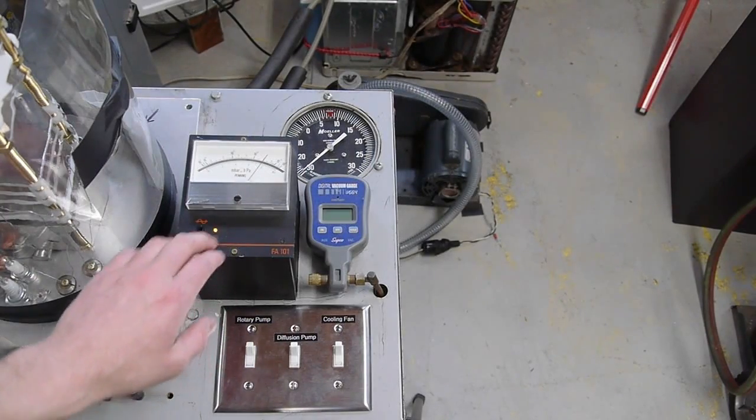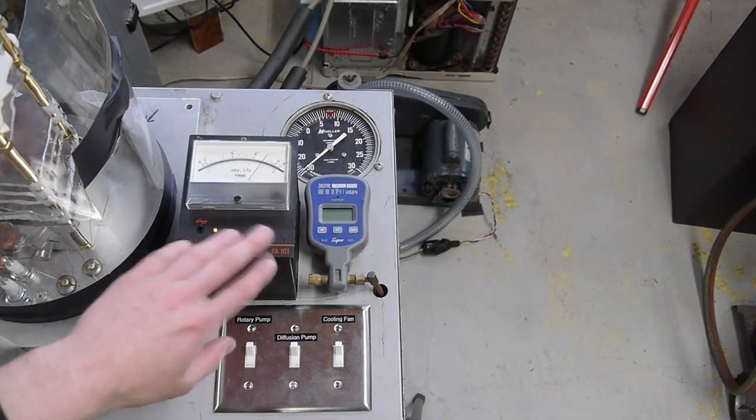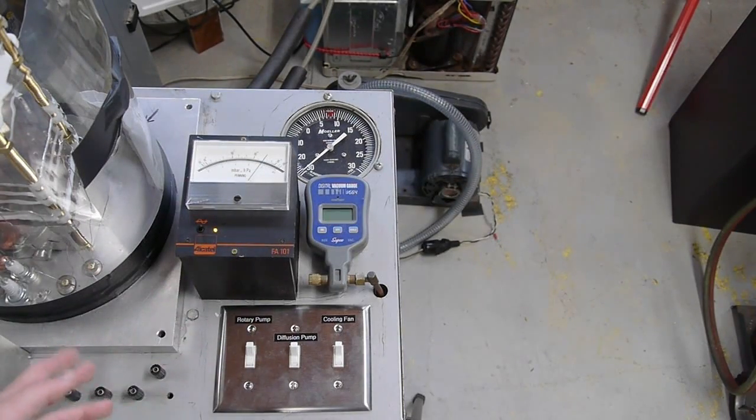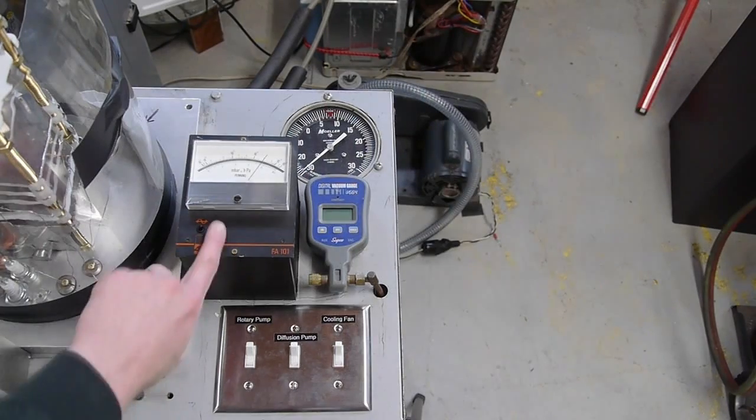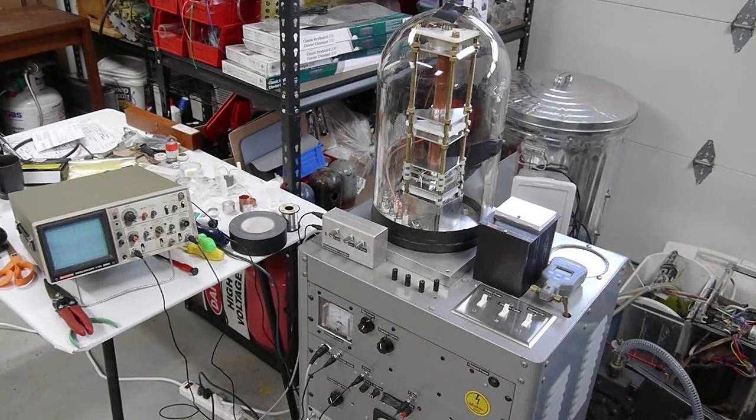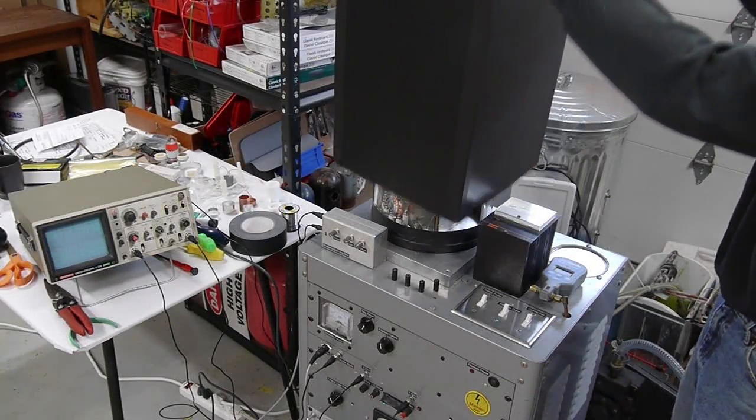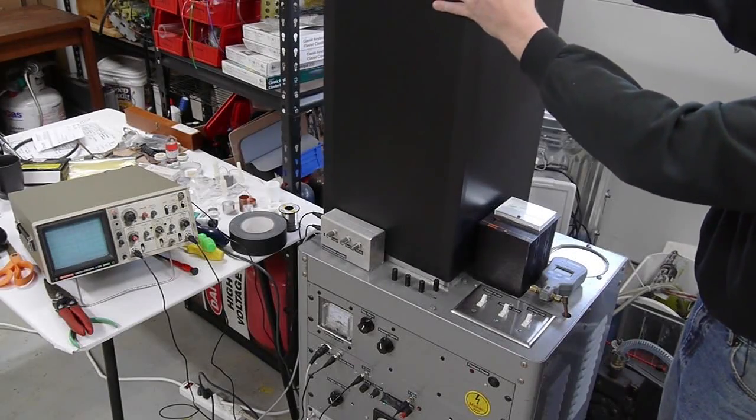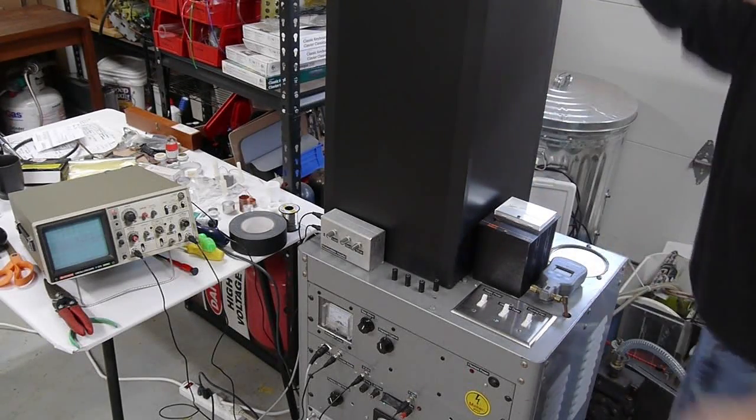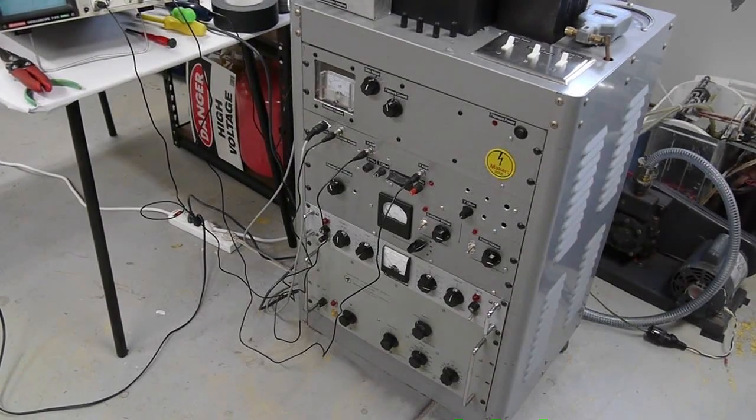The penning gauge is now reading 2 times 10 to the minus 4 millibar, which is pretty close to 2 times 10 to the negative 4 torr. So that's good enough. So I'm going to switch this off to avoid causing interference later. The next step is to put the light tight shroud on the microscope. What we're going to be doing is light sensitive. So I'm going to put this Coroplast black plastic to cover that up.